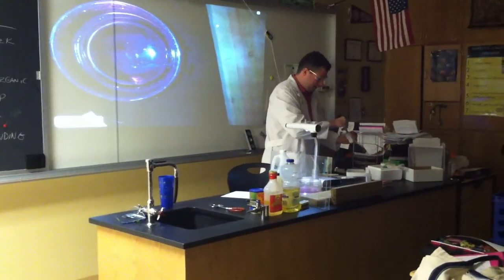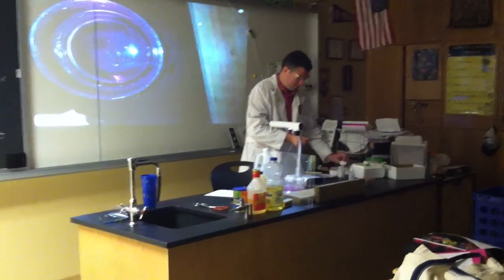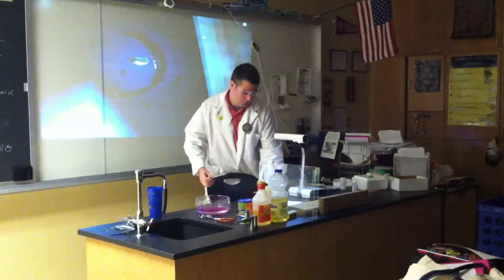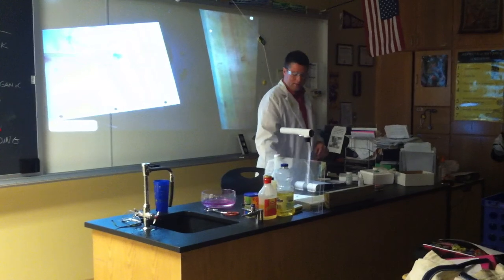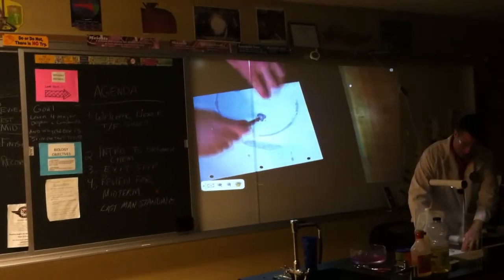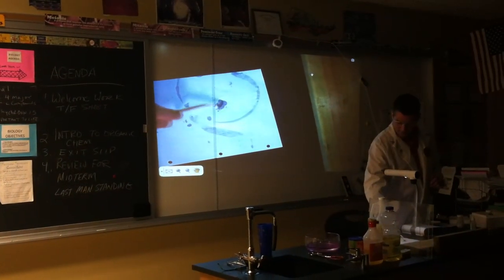All right, so these are in even smaller chunks than lithium because that's how reactive it is. I'm going to show you guys this under the microscope. So this is a piece of sodium. Again, this is very highly oxidized, but this is even softer. And if you look at the inside, you can see hopefully the shiny. Can you guys see the shininess? It's hard to see.